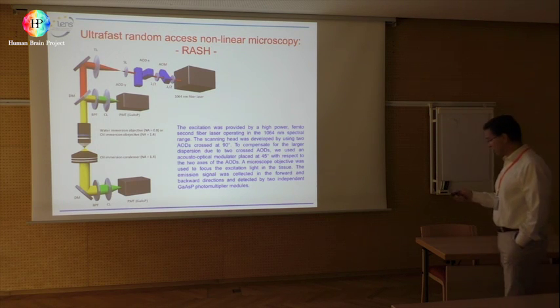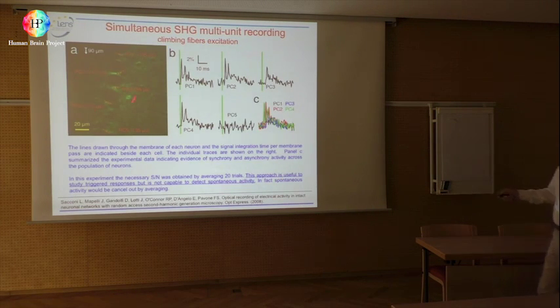And with this kind of technique, for example, in acute slice, I can image more than 1 neuron in parallel. This is, for example, 100 micron depth, single cell resolution, cerebellum. This is acute slice, for example. And here I can image, for example, 5 Purkinje cells, and you see this is a complex spiking behavior.